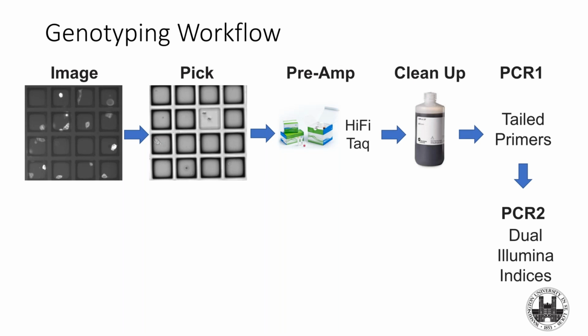So we're doing DNA amplification here, right? In this case, we don't care at all about the RNA. We're just looking for the genomic edits, right? So this is PCR to genomic DNA, which is only 2 copies of most genes. So the front part of this pipeline has to be optimized for your lab to make sure, because it's a very low yield input, right?